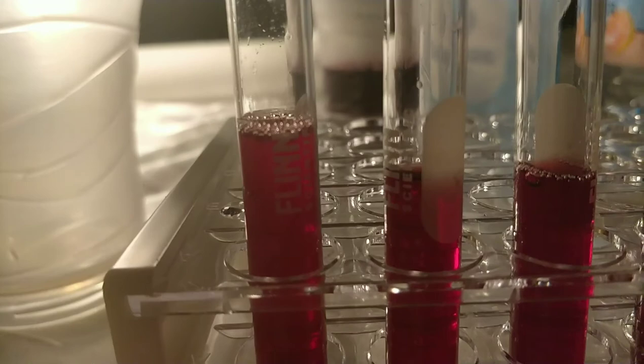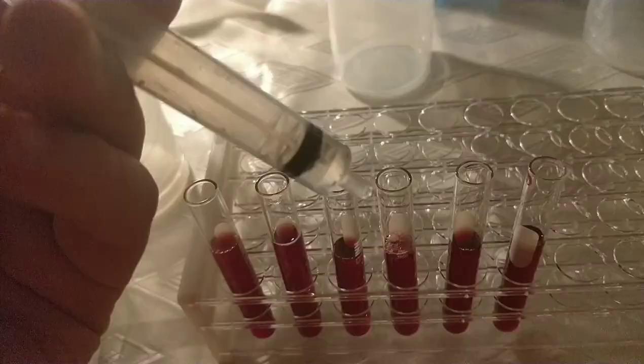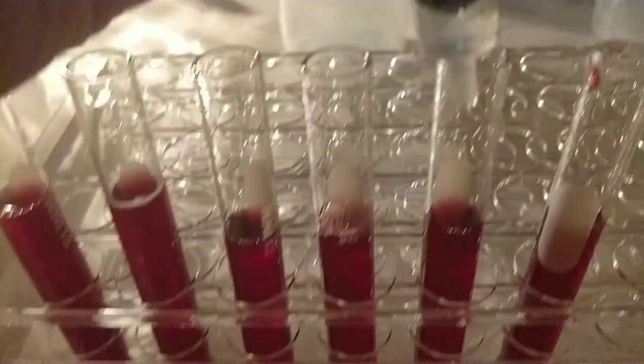Here we have one milliliter of the ammonia added to the grape juice — still a solid purple color. Next I'll do the antacid — adding it to the test tube. It's still red or purple — it stayed purple once again.